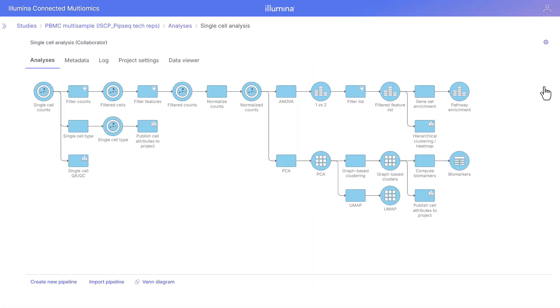This completes our tutorial on single cell analysis. Please see our videos on related information for other assay types and navigating the data viewer for visualizations.